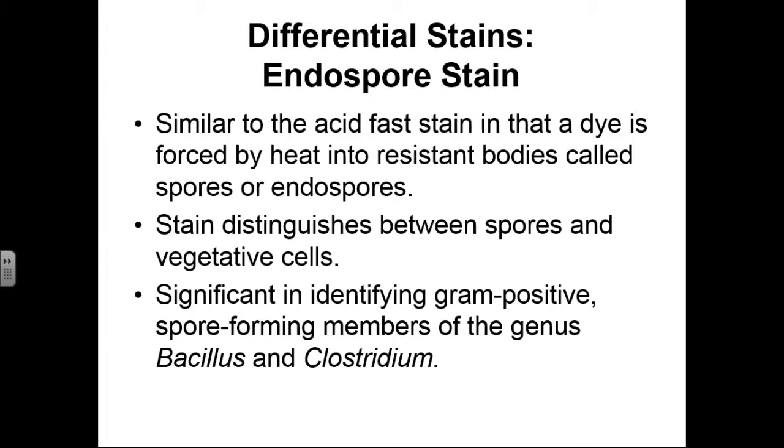One of the reasons for this is because it's more of an art form. And I should say that all staining procedures are, in some sense or some degree, an art form, but particularly the endospore stain, because it involves steaming your microorganisms and air drying and air fixing, and there's lots of extra steps involved with this procedure. You'll find out when you do your online lab activities.